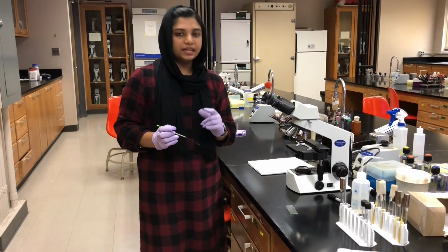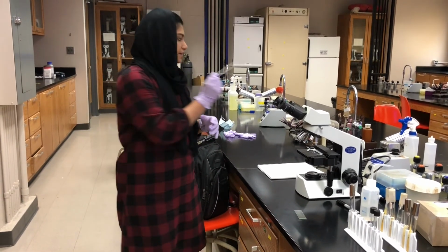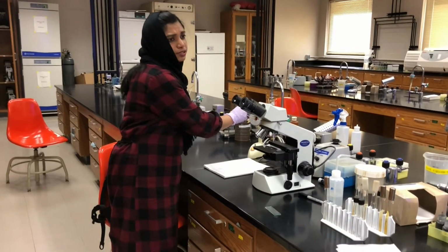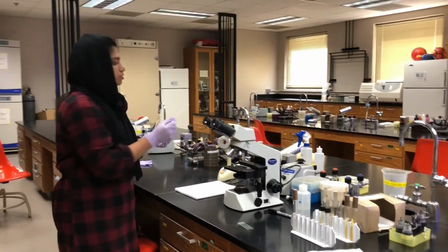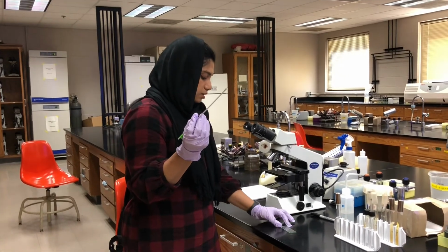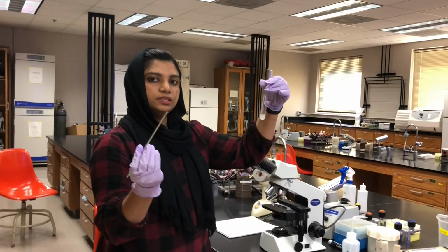Now we're going to do the indirect staining. For that, the same as we did for direct staining, I'm going to sterilize the loop and add like 2 to 3 loopfuls of culture onto the slide. So it's sterilized. We are using a mixture of the broth that we used in the last class.